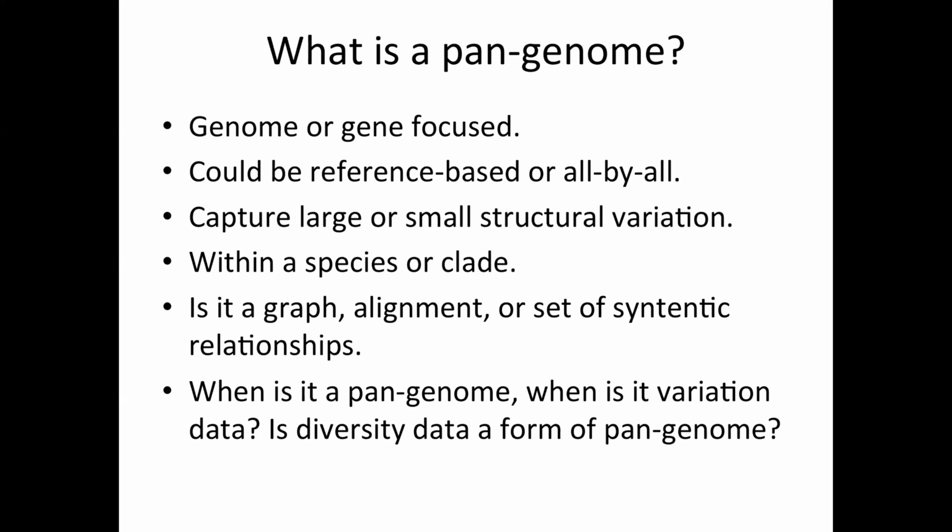It could be genome-based with a graph concept, or it could be a collection of gene sets, could be within a species, or it could be within a broader clade, etc. I kind of like the term pan-gene atlas.